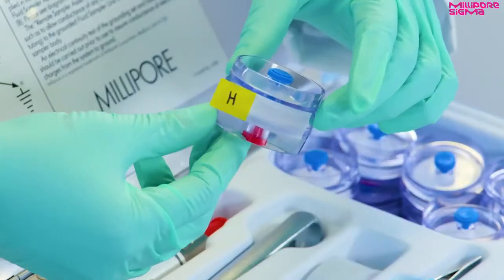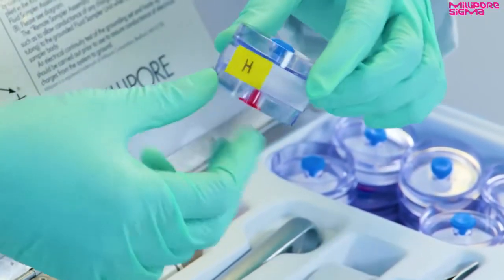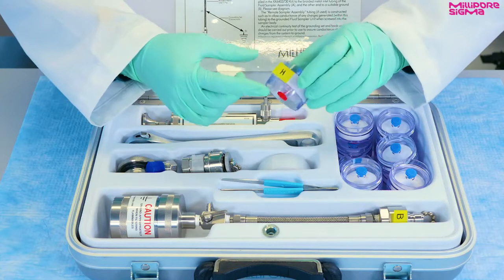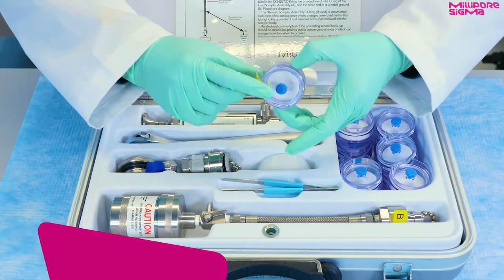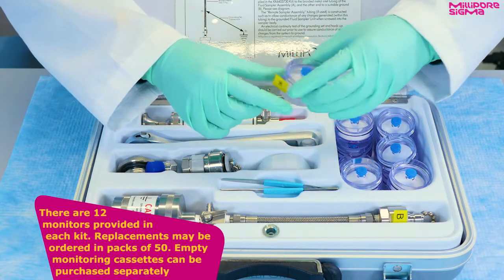These are two-piece 37 millimeter 0.8 micrometer MCE monitors with a red plug on the outlet and a blue plug on the inlet. There are 12 monitors provided in each kit.